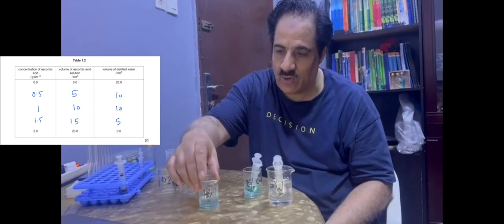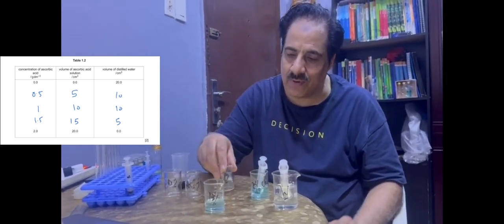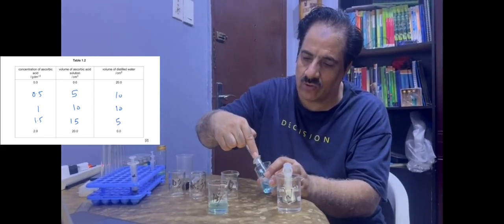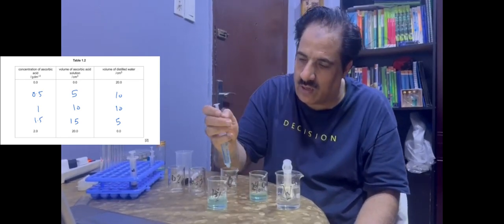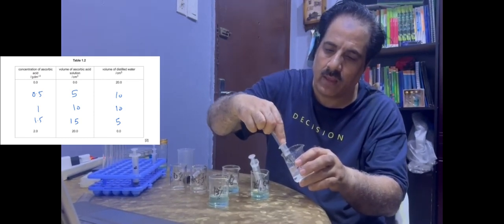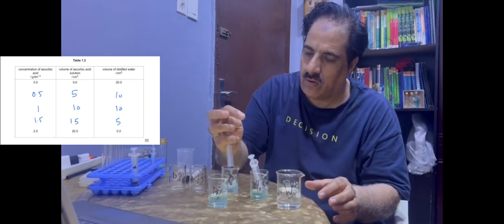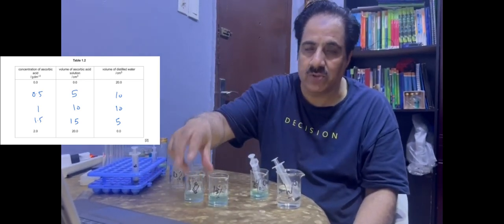We have to do the dilution of the stock solution always in case of the proportional dilution. Now in order to make it 1%, we'll take 10 centimeter cube of the stock solution. This is 10 centimeter cube of stock solution, and to this we will add 10 centimeter cube of water. So we have got the 20 centimeter cube of 1% solution.